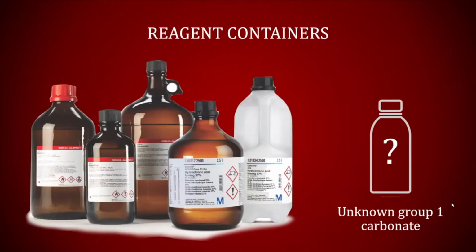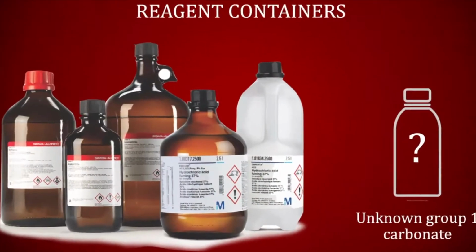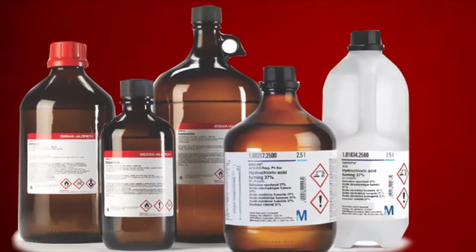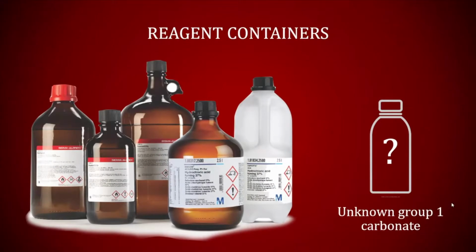Most compounds come in reagent bottles that are clearly labeled with the contents inside, their formulas, the amounts, masses or volumes, and concentrations if they're solutions. Occasionally, we come across bottles that have torn or missing labels, and we do not know the important details about what's inside those bottles. Today's lab is meant to simulate this scenario.